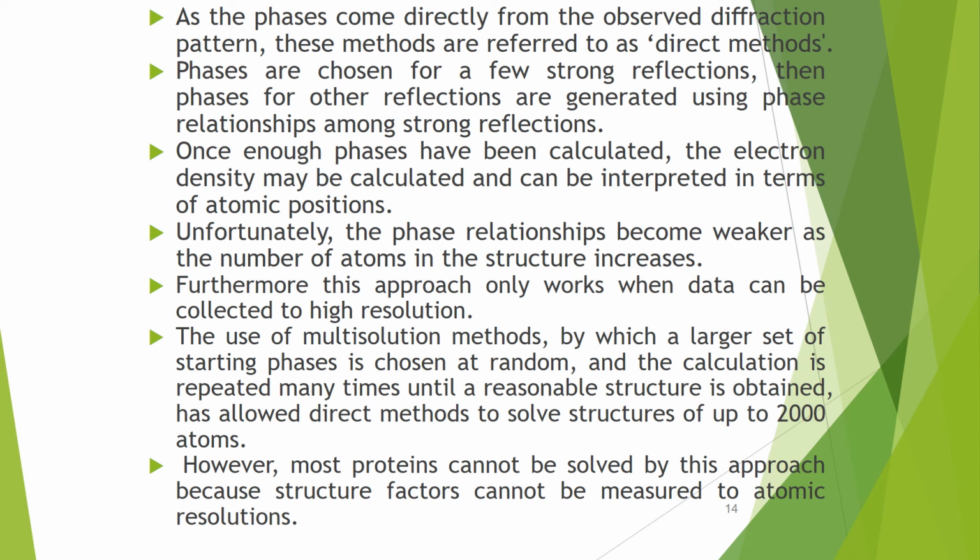The use of the multi-solution method, by which a larger set of starting phases is chosen at random and the calculation is repeated many times until a reasonable structure is obtained, has allowed direct methods to solve structures of up to 2000 atoms.